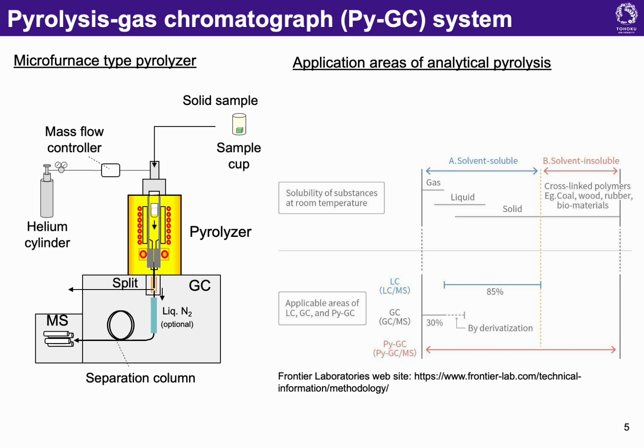On the other hand, if we want fast pyrolysis conditions, the sample cup is located at the upper part of the furnace, which is outside of the furnace, until the furnace temperature reaches the desired temperature. When the furnace reaches the desired temperature, the sample cup is dropped into the furnace. Thus, microfurnace type PY-GC allows both rapid and slow heating and a broad temperature range.